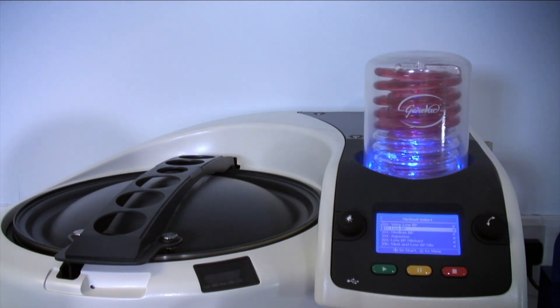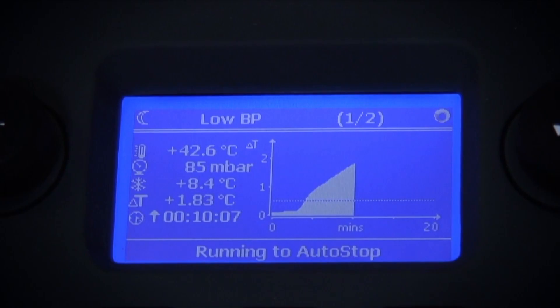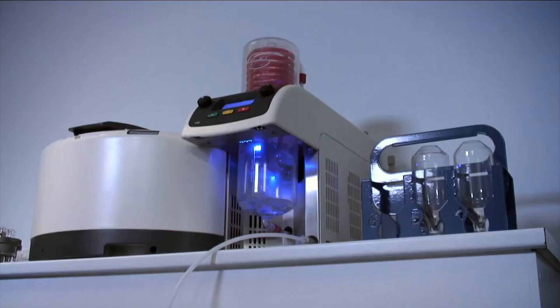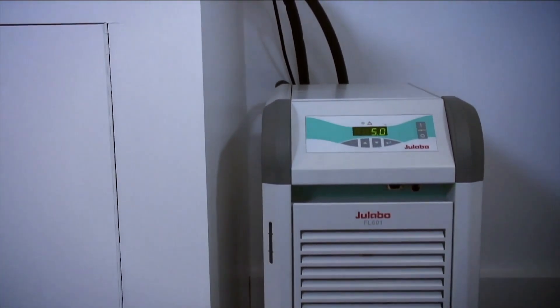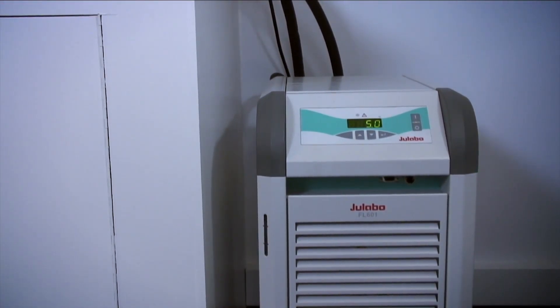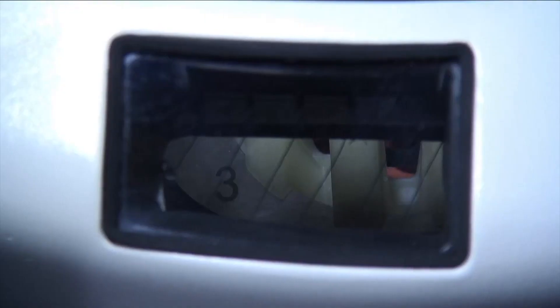The cold trap collects the vapors, condensing them to a liquid. You can monitor the progress of evaporation using the delta-t graph that calculates the difference between the coolant temperature entering and leaving the cold trap. When this value approaches zero, evaporation is close to an end. The strobe may also be used to directly monitor progress.